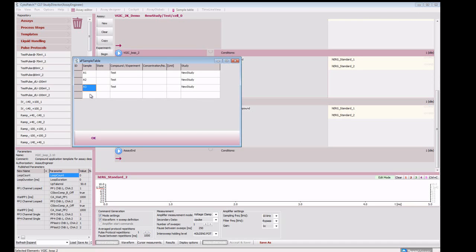compound, and we can define the position of the compounds in the compound rack with the window that is popped up. And we choose a position, and we write the name of the compounds for each of the positions. If we're using the same compound, it's going to be quinidine for position A1, A2, A3, and A4. And thereafter, we want to write a concentration.